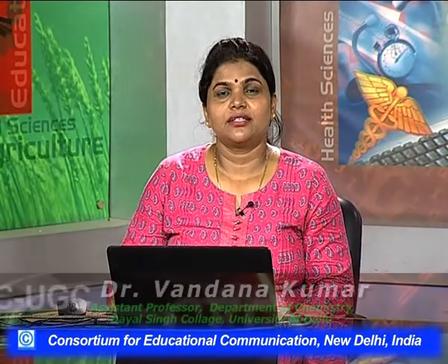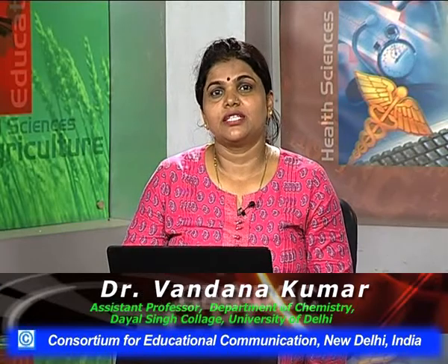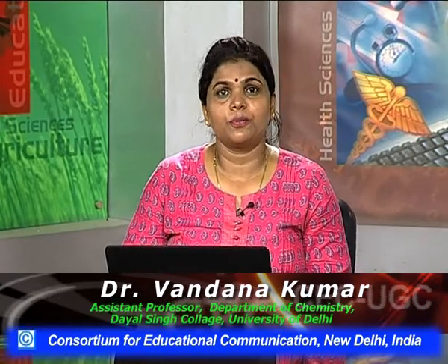Hello viewers, in the series of natural products and spectroscopy, today's lecture is on IR spectroscopy. As we know, what is spectroscopy? Spectroscopy is nothing but interaction of electromagnetic radiation with matter. For organic chemistry, it helps us to analyze a given unknown organic compound. What is spectroscopy? Interaction between matter and electromagnetic radiations.